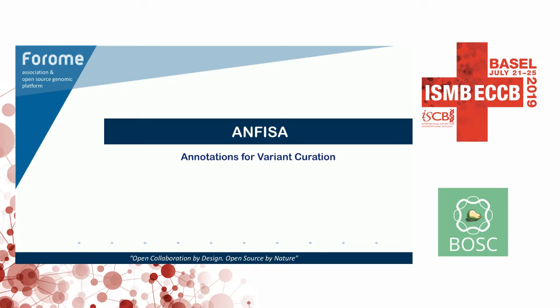Good morning and welcome. I'm Michael Buzinger and I work for Brigham Genomic Medicine program, and in the next 5 minutes I'm going to introduce you to Anfisa, which is our variant curation tool.